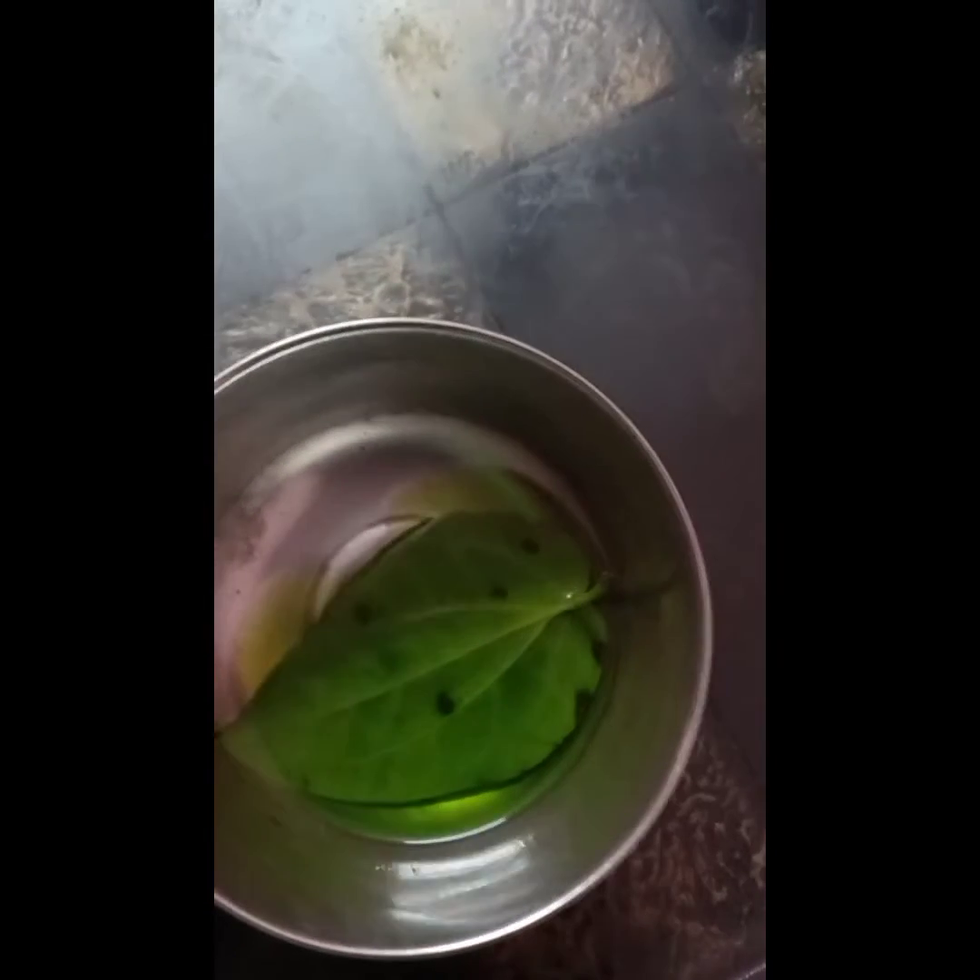See the color change here. The alcohol has changed to green color, as chlorophyll is green in color. This shows the removal of chlorophyll into the alcohol.